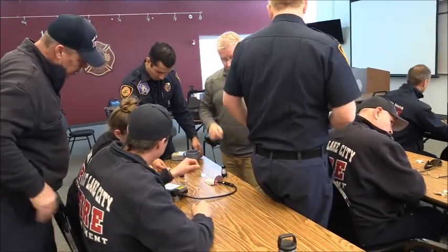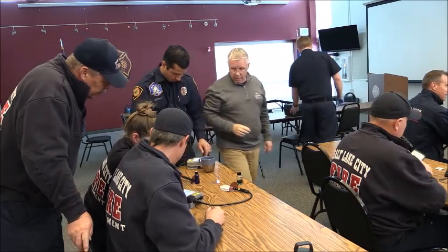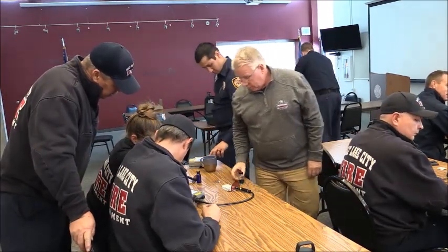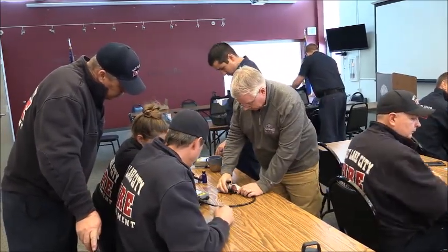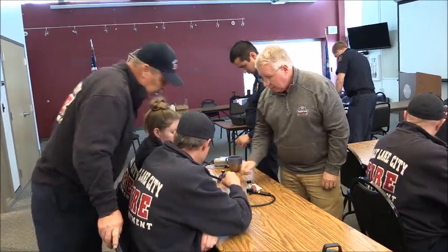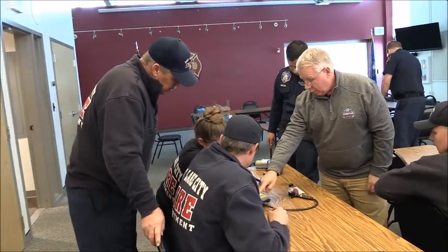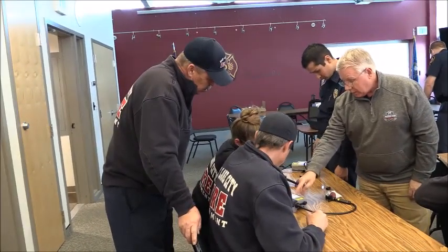So it's already done. You're going to get rid of it. So green, so it's the device saying that I'm asking. Now, press enter. View info, view spectrum. What is acetone?